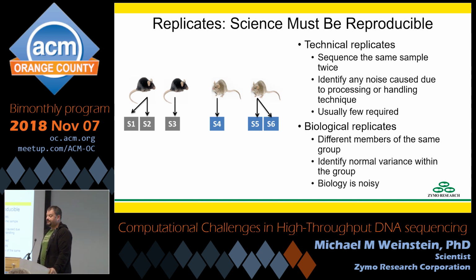There's technical replicates. A technical replicate is taking the exact same sample and running it through your pipeline twice. This is extremely useful for identifying things like if your technician is sloppy, or if your machine isn't being accurate every time. In computer science, I would say this is running the same set of data through the same function to make sure that the outcome is deterministic and not random, or occasionally to make sure that the outcome is random if that's what I want. With sequencing, you typically don't need a lot of technical replicates because the sequencing technology now is pretty reproducible. That said, it's always good to have.